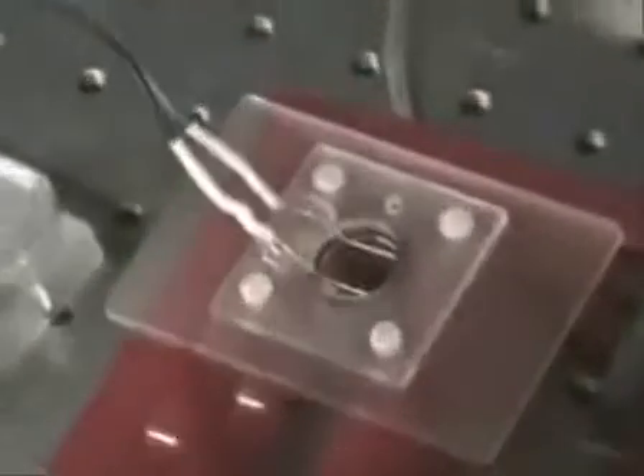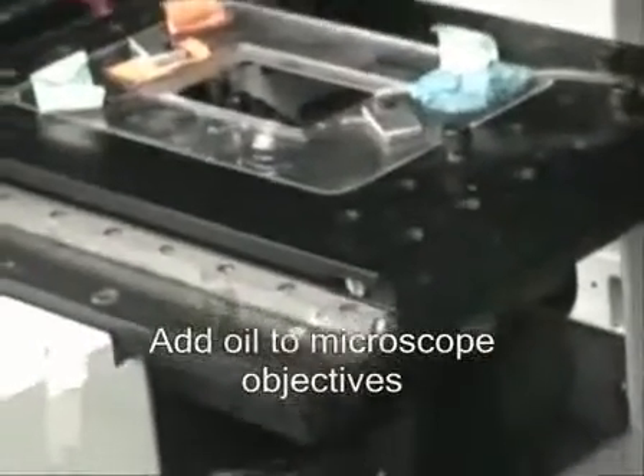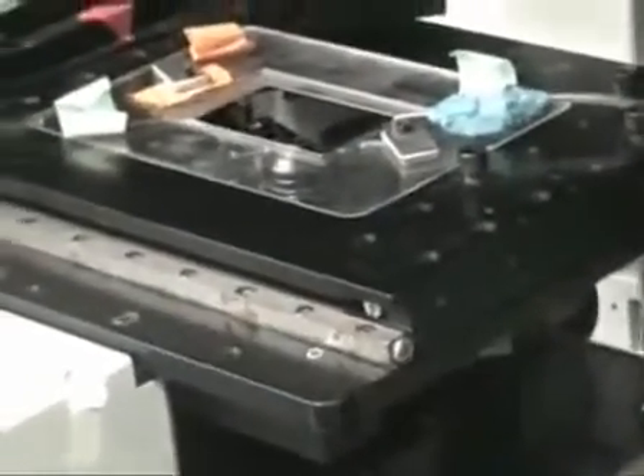Our microscope is an inverted CCD, and make sure to thoroughly dry off the bottom of the hood.